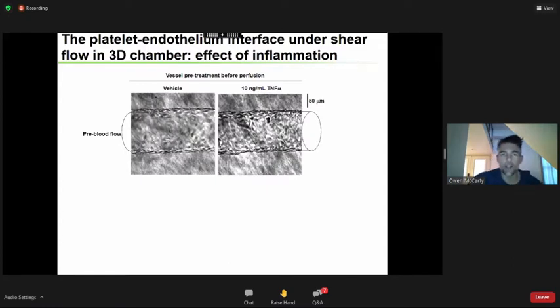This is the next component. We showed you originally that model of the blood cells, the artery and the vein, coordinating that blood flow. And here I wanted to do something just in a microscope setting. How do I actually study that?